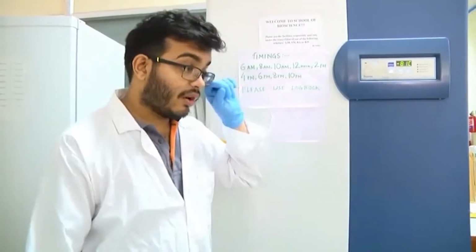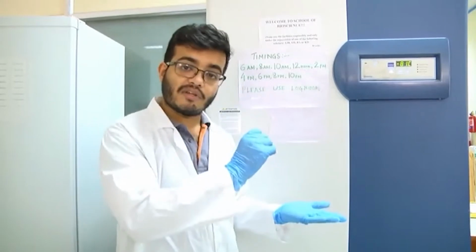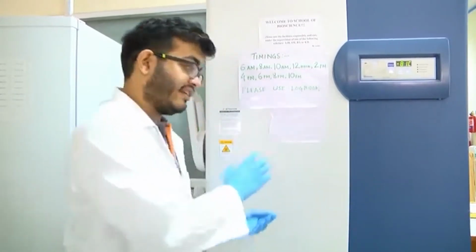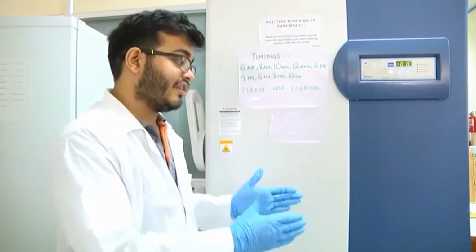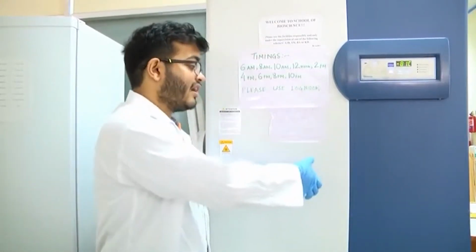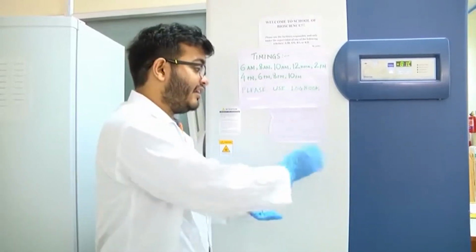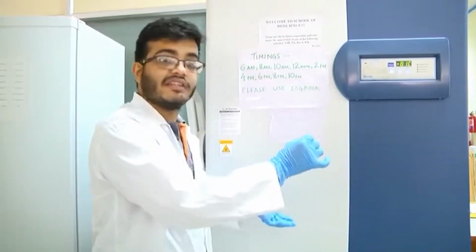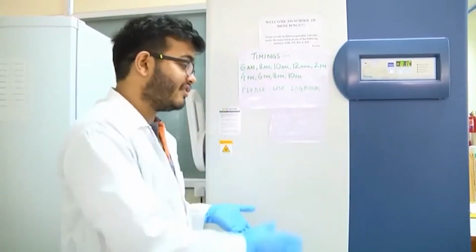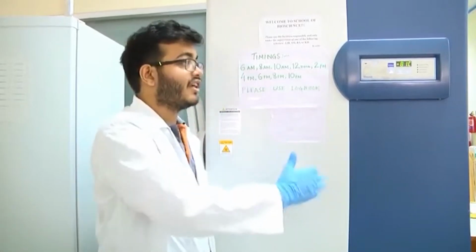The objective for our next step is that I will take out a vial of chemically competent DH5 alpha bacterial cells, and I will keep them in ice. For the actual process required for an experiment, I have to do it very fast. I ideally should not take out the whole box, and once I take out the vial from minus 80, I cannot roam around holding it in my hand. I have to immediately put it in ice. During that portion I will not be able to talk much, but before that I am giving you an overview.